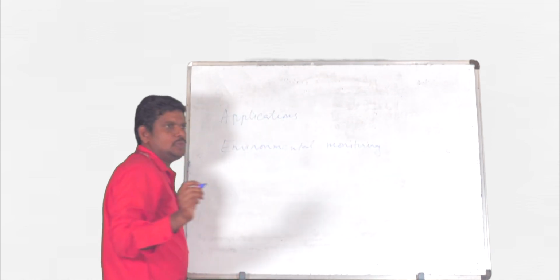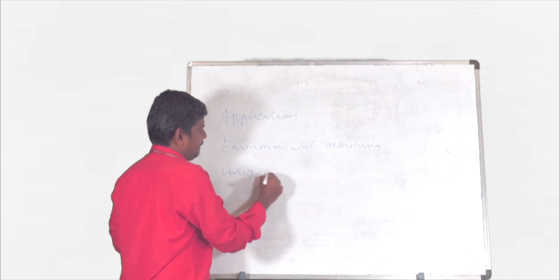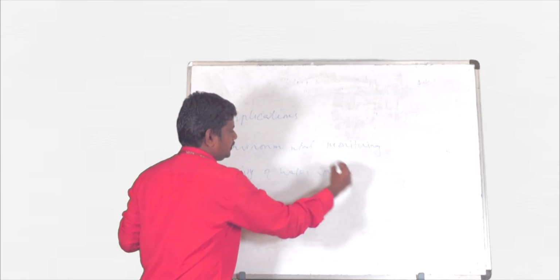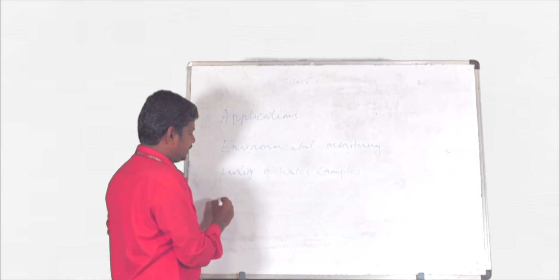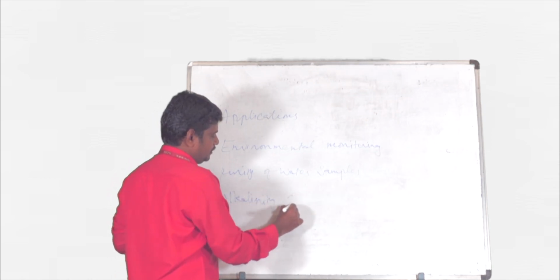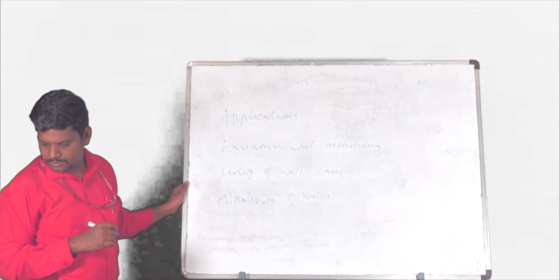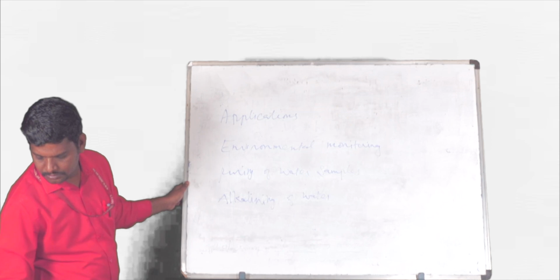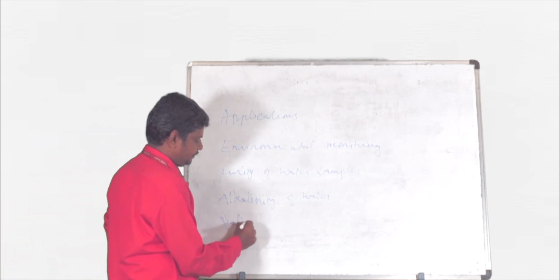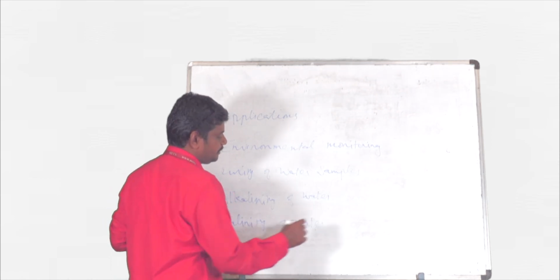It is used to determine the purity of water samples, the alkalinity of water, and the salinity of water. Likewise, there are so many applications of these titrations.